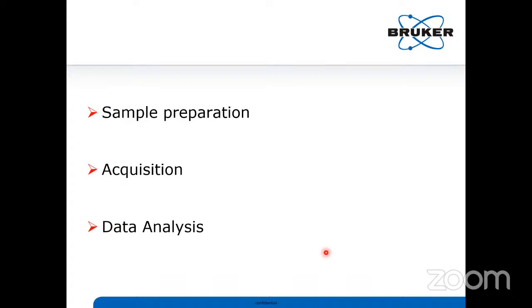You should know exactly what method you have to use for the particular sample. If you are using any high mass, for example, intact level mass, protein mass about 150 kilo and all, you should know what scan range you have to keep for your particular mass spec model.